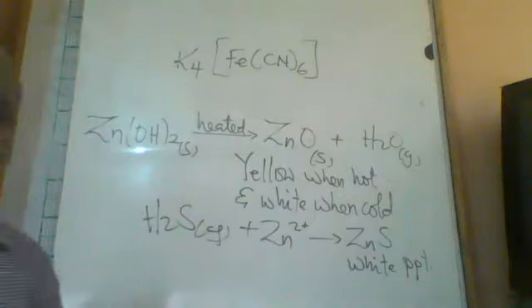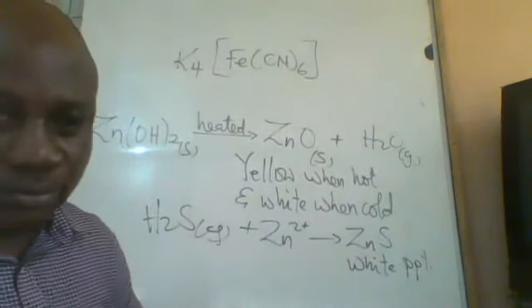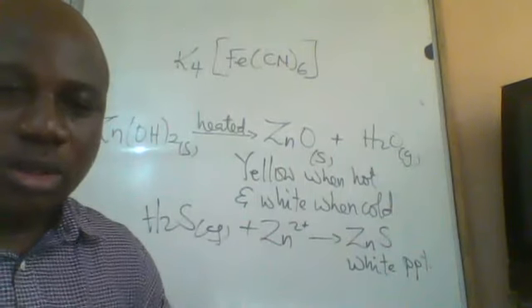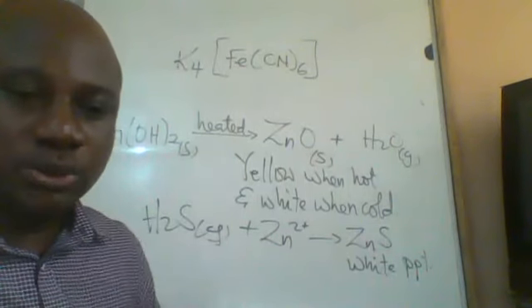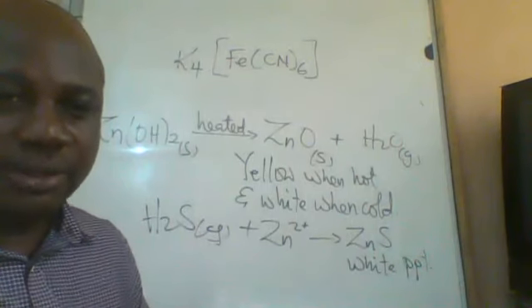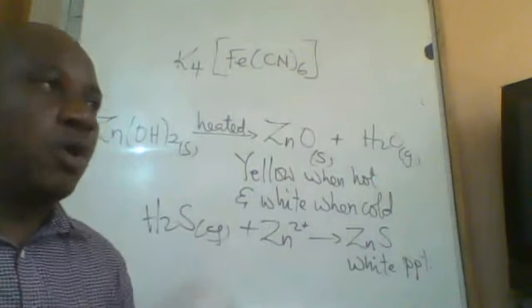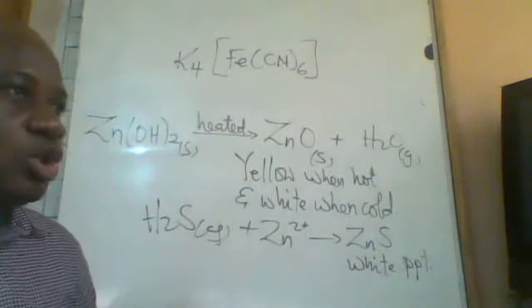It's a complex salt. That can also be used to confirm the zinc. Then we come to lead, the next ion. For lead, we can use 4 different reagents to confirm it.